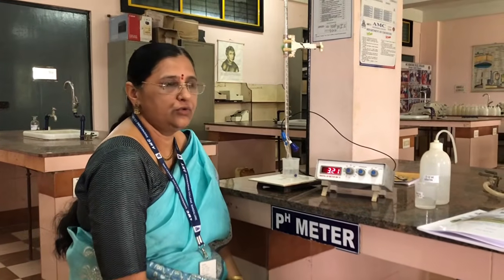So first we have to know what is weak acid and what is the difference between strong acid and weak acid. You all know that weak acids are the acids which partially or incompletely ionize in their aqueous solution. That means if you take it in water, they will be partially ionized. For example, acetic acid, CH3COOH, or formic acid, HCOOH, these two are weak acids.